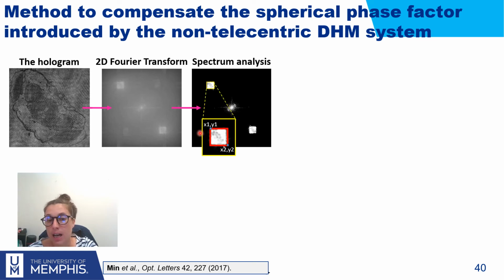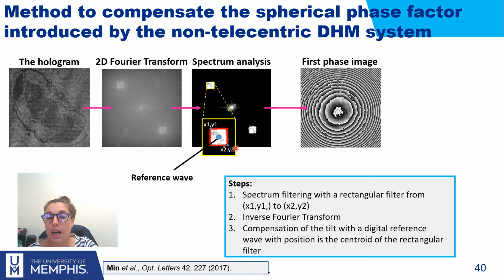And if I have the size, then I can definitely filter out my +1 term, but I can also see the radius of curvature, because it's kind of an equation, and I know that the reference wave is kind of like in the middle. The interference angle is going to be this middle term of the +1 term. So I filter out the +1 term.